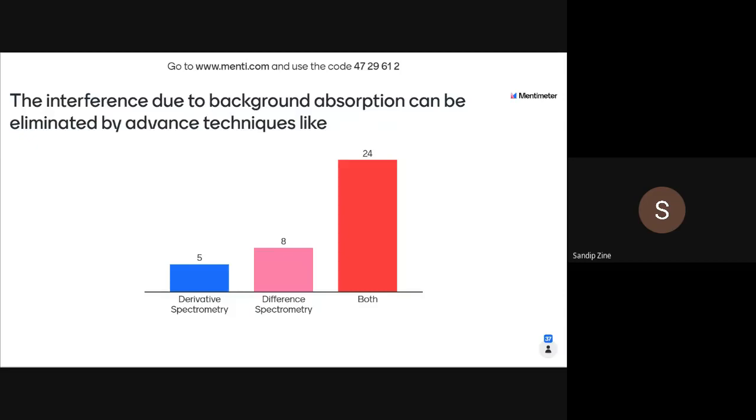According to that, the software calculates the derivatized form of absorbance with respect to the wavelength.